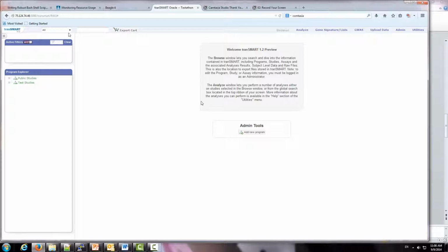Then users can use the filter to further narrow down the list. For example, if the user is interested in cancer studies, notice that between the search categories, it's the and relationship.